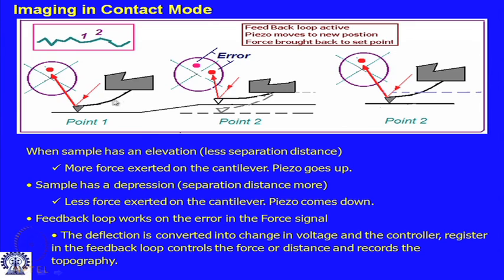You can understand now a lot of things. You can understand why the shape of the cantilever is like this, because it is deflected. It is deflected because it is in the repulsive regime. The laser light falls and gets reflected from that small tiny reflection zone which is there on the cantilever. The laser light gets reflected and falls at the set point on the PSPD.